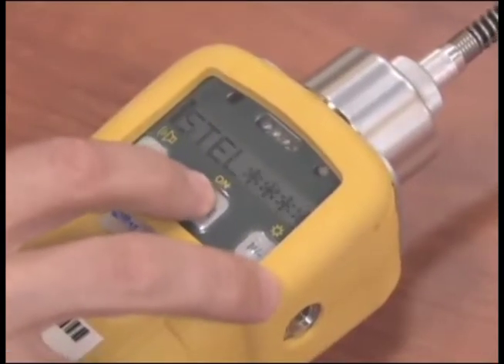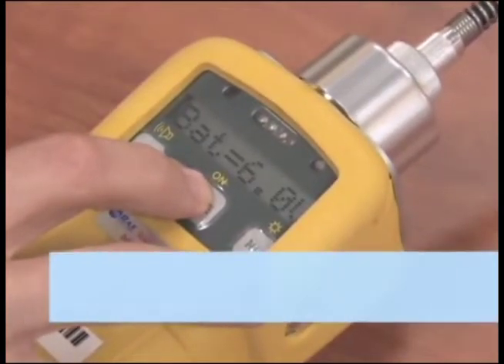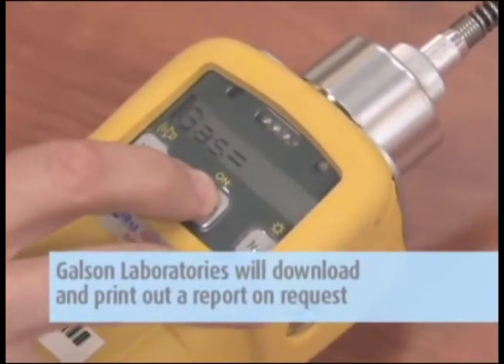When your sampling event is complete, you will need to download the data to a PC to print out a report. Galson Laboratories will download and print out your report on request.